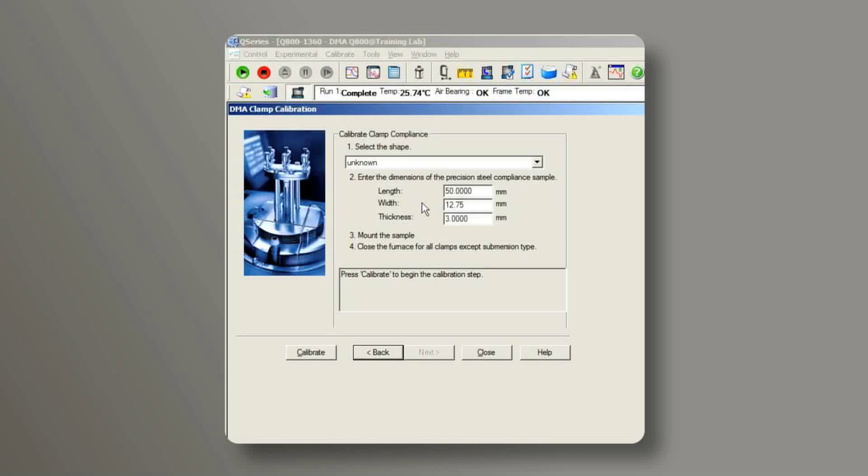Please remember, the length is the length of the clamp. Then click on Calibrate.